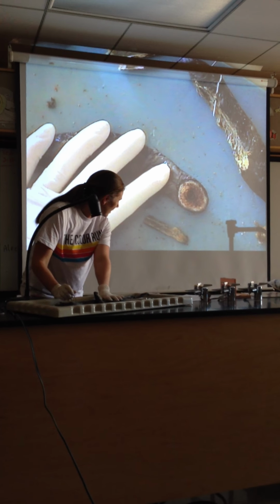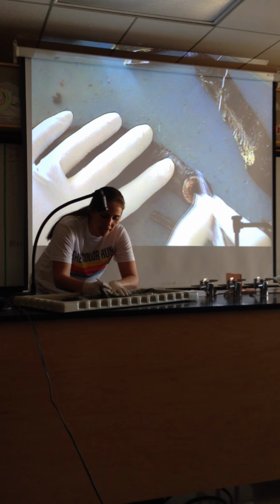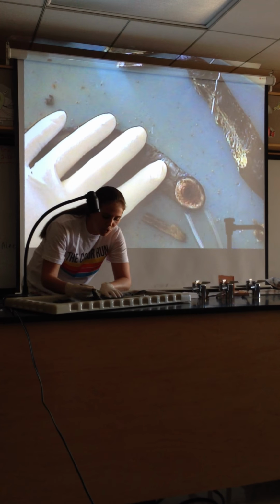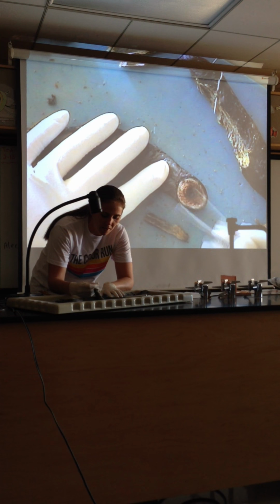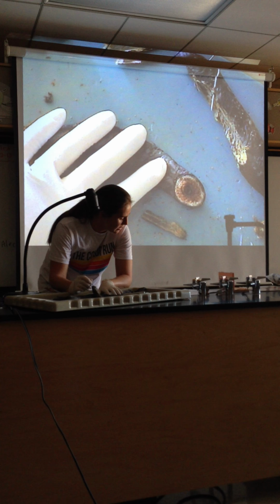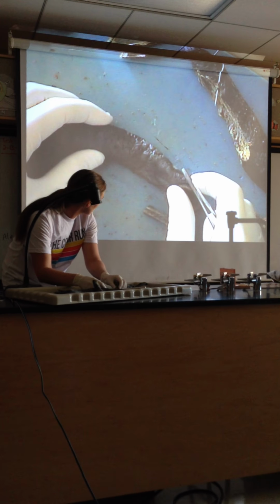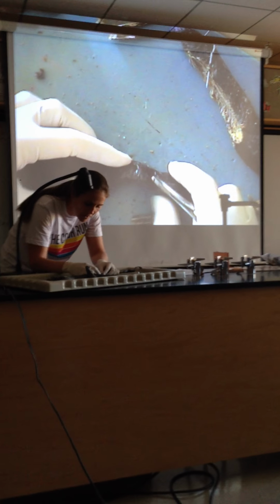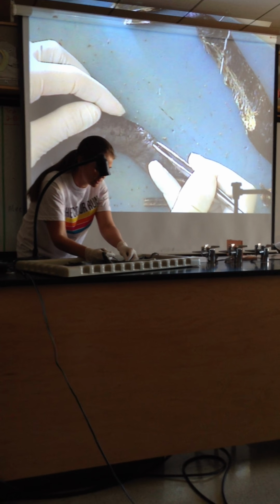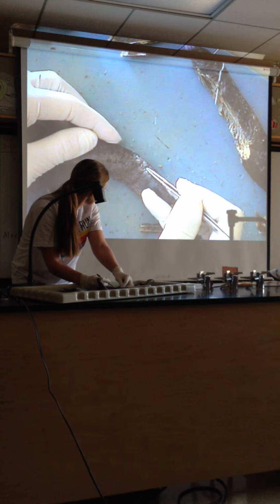All right, fabulous. Okay, so what you're looking at is the oral cavity, or the oral region, that I asked you to take a look at. You have the buccal funnel, because that is the mouth itself. As you go through the dissection, it asks you to notice the gill slits. If I slightly turn this organism to the side here, you're going to notice a series of openings. You guys see them all there? Yeah. All right, these openings right here are the gill slits.